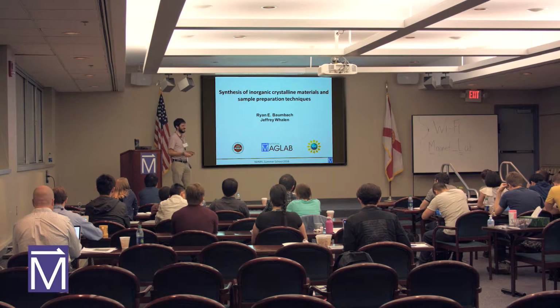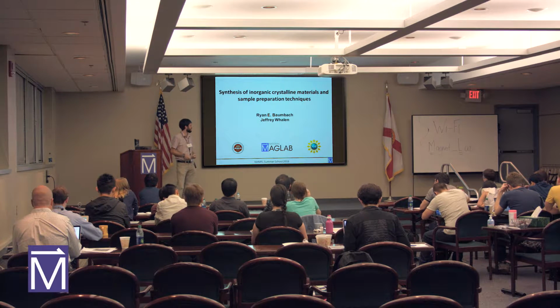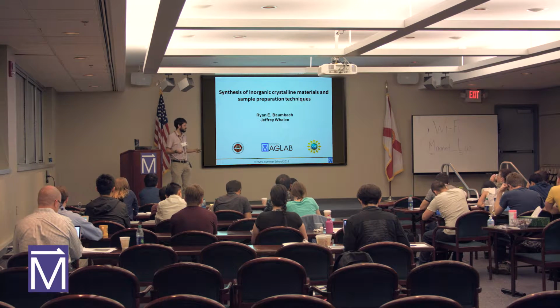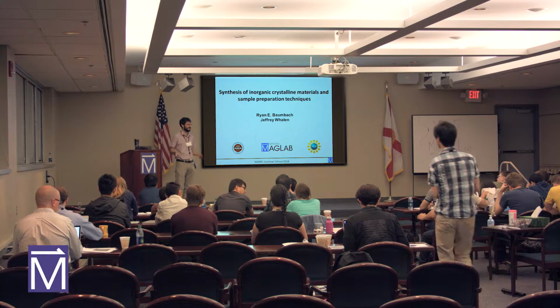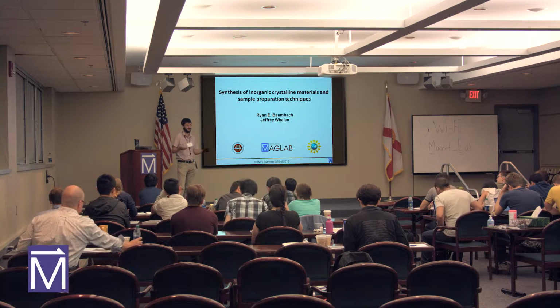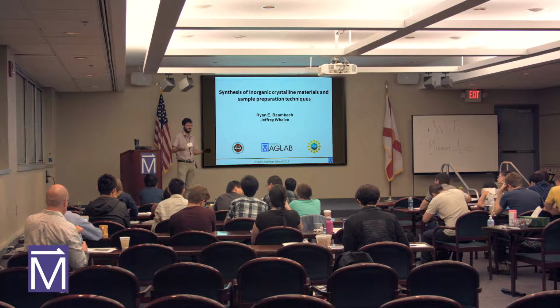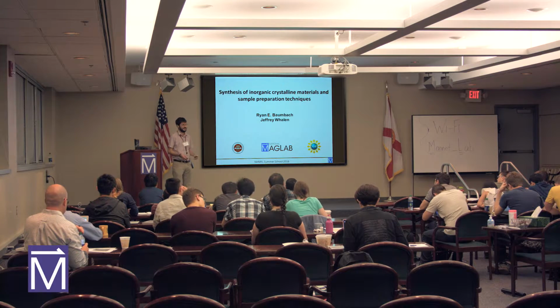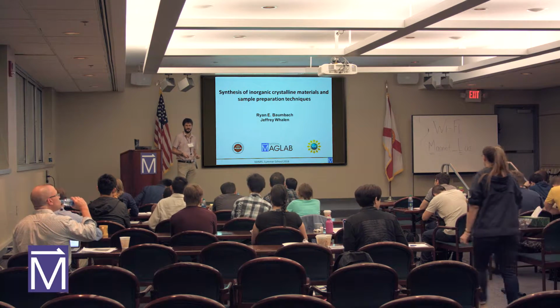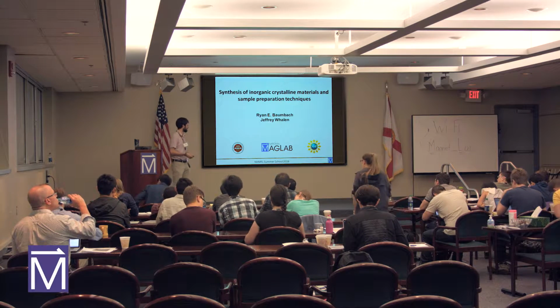Okay, so what I'm going to tell you about are some of the things that we do here with respect to synthesis of inorganic crystalline materials and our sample preparation techniques. Before I proceed, I should say that there's an even larger universe of types of materials that you could grow, like polymers and fancy devices. That's not really my specialty, but if you were interested in those sorts of things, I might be able to point you in the right direction.